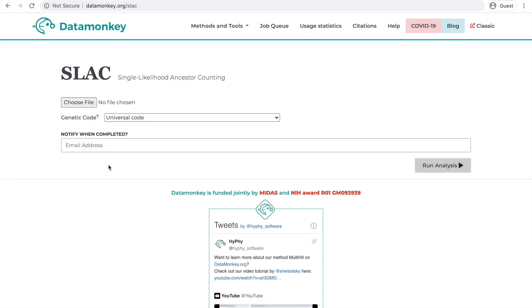Then you'll see the SLAC landing page where you can upload your sequence file of choice, choose what genetic code you need to use, and enter your email if you wish to be notified when your analysis is finished running, which I highly recommend.